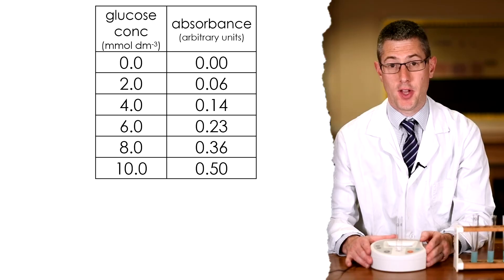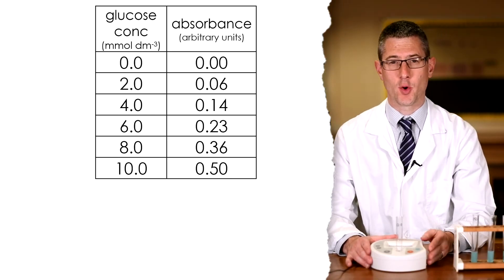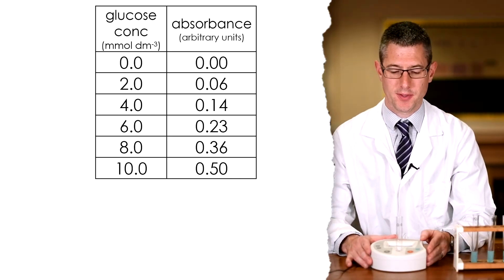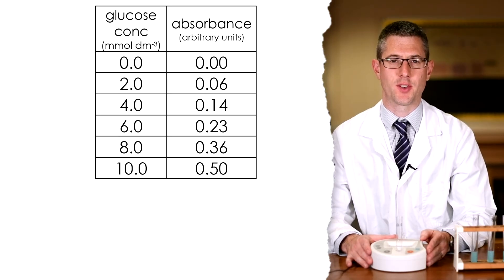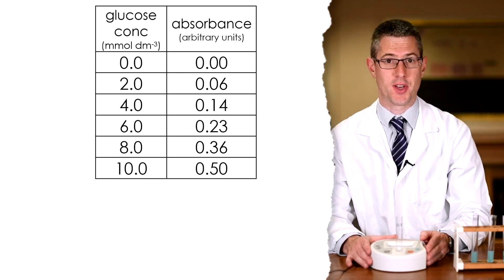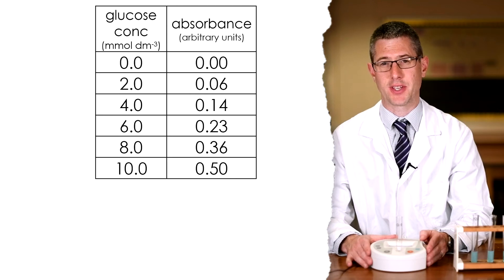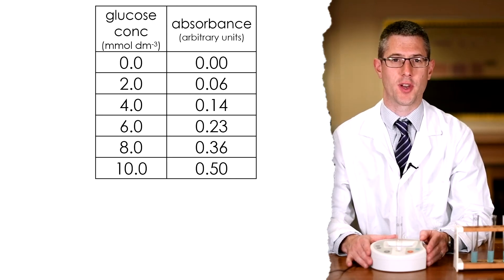So now having measured all of my known glucose concentration samples, I've got a quantitative readout of light absorbance. We have to now measure the absorbance readings of the unknown urine samples to get a quantitative reading that can allow us to calculate what concentration of glucose is in those samples.